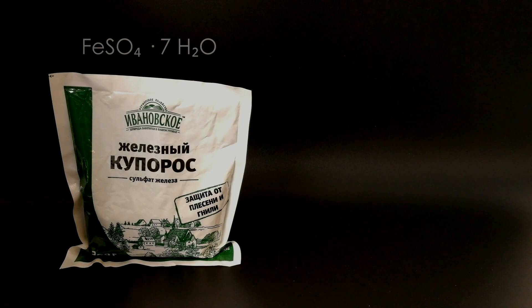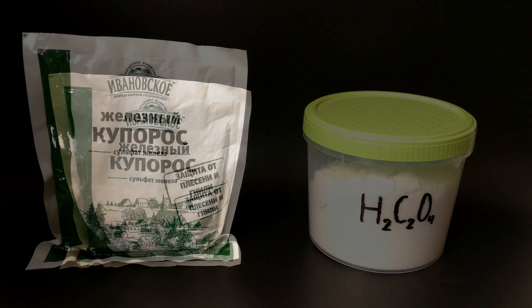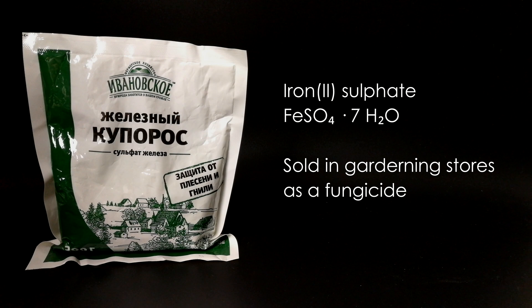This synthesis will first of all need iron 2 sulfate and oxalic acid. Iron 2 sulfate heptahydrate or simply ferrous sulfate can be easily bought in a gardening store where it is sold as a fungicide.